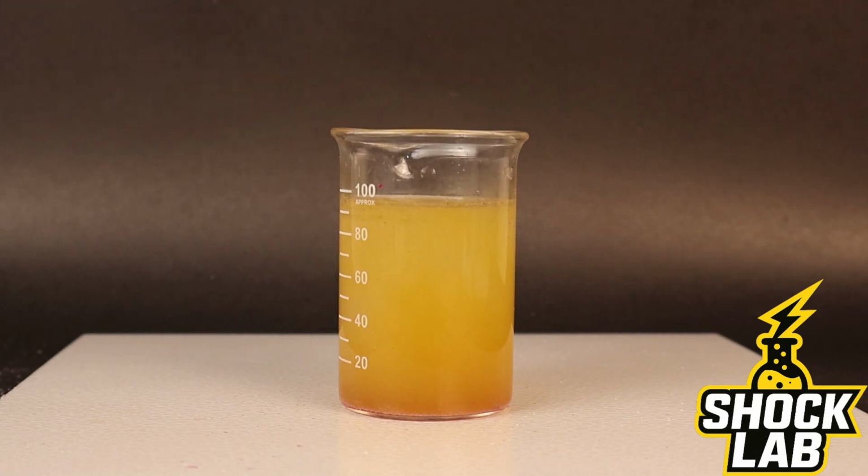3 different colors, 1 solution. And all of these changes happen simply by controlling the pH.